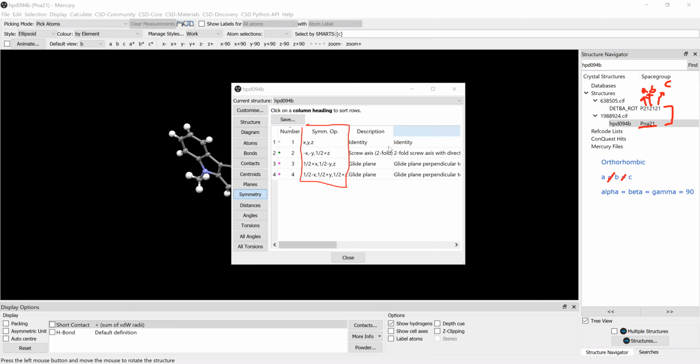And so the way you know which one you have a reflection, just to give you a little prequel, is, here is X, Y, Z. When we have a screw axis, 2 of the coordinates become negative. So a screw axis parallel to C means that X and Y become negative.